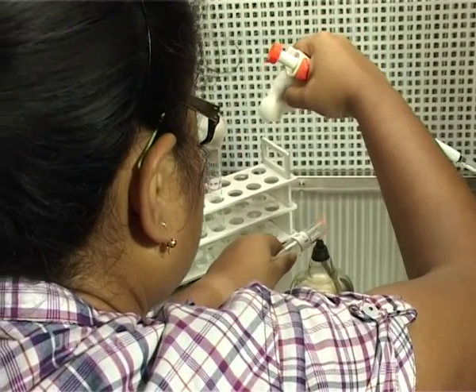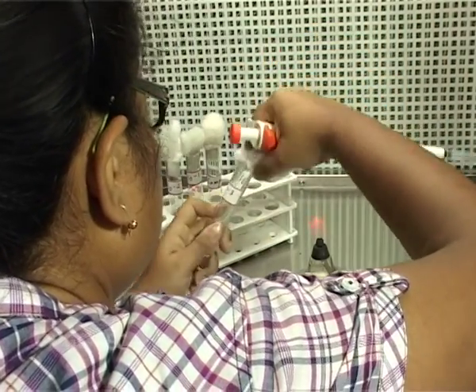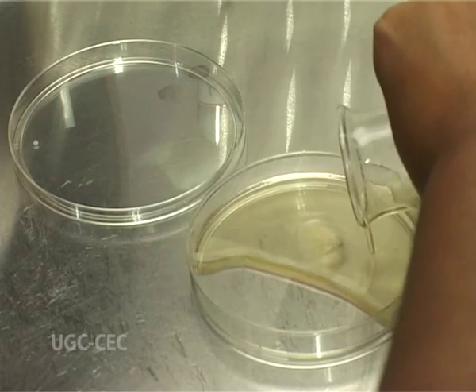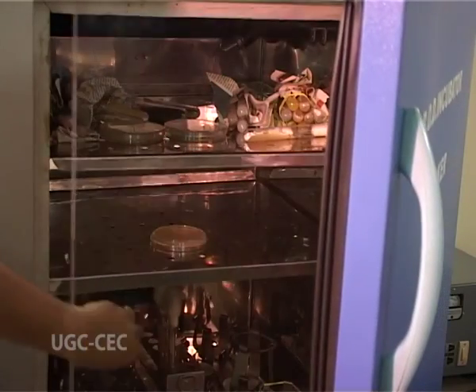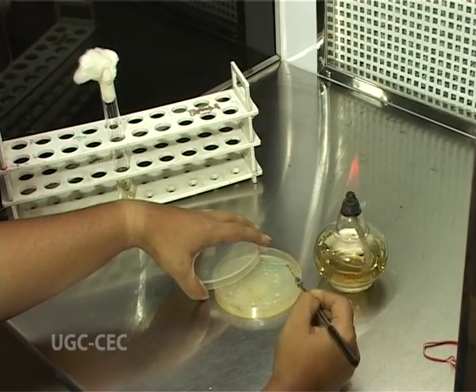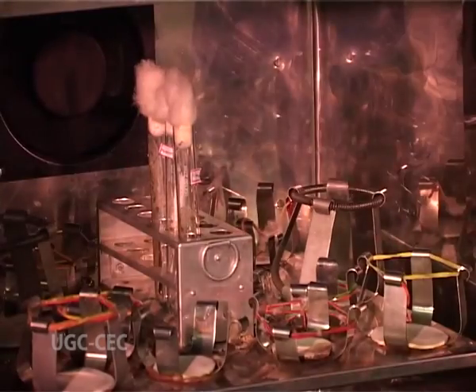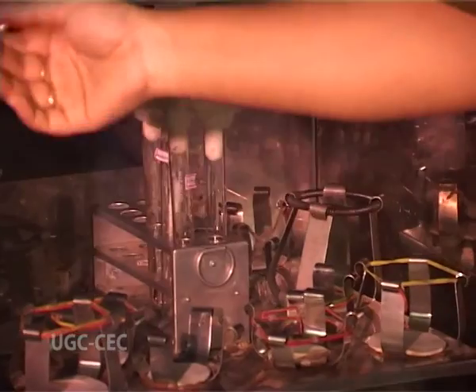The inoculum is prepared by diluting the sample to be tested, usually 10 to the power minus 3 or minus 4 dilution is taken. A pure plate culture is prepared with the requisite sample. It is incubated overnight at 37 degrees centigrade in an incubator. The desired organism is touched with an inoculating needle and suspended in 2 ml nutrient broth in a culture tube which is sterilized. The suspension is also incubated in a shaker at 37 degrees centigrade overnight.